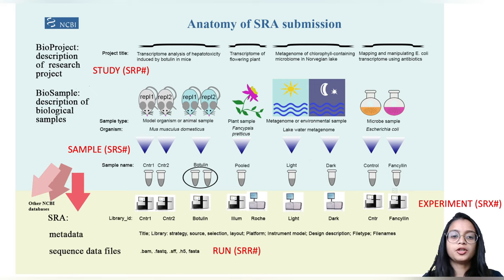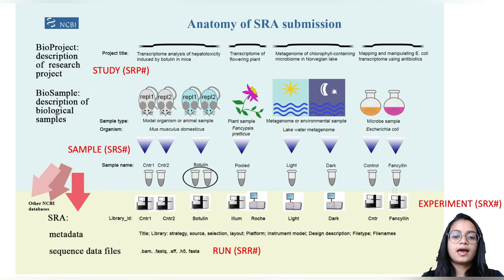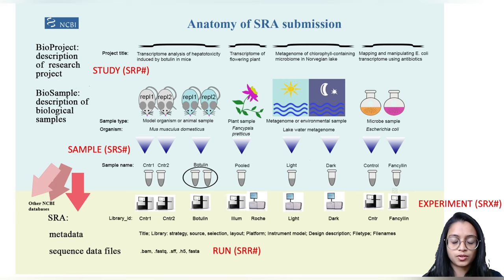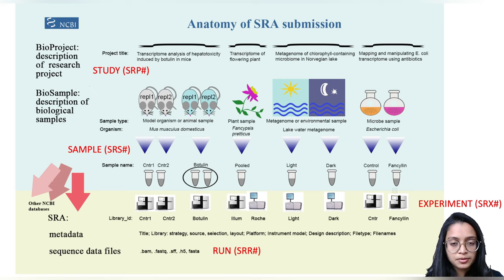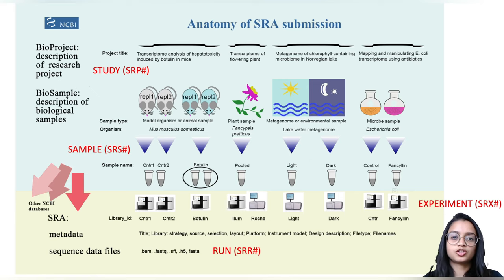We can find information about the project, which is equivalent to the study, where we have a description of the research project. These have accessions starting with SRP. We can also find information about the samples, which are extracted or which fall under the study. Each of these individual projects also describes a bit about the samples and what organisms they are coming from, and these records start with accessions starting with SRS.